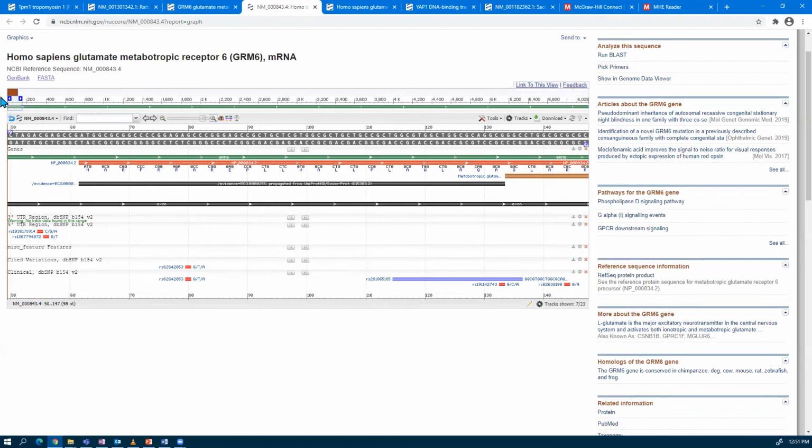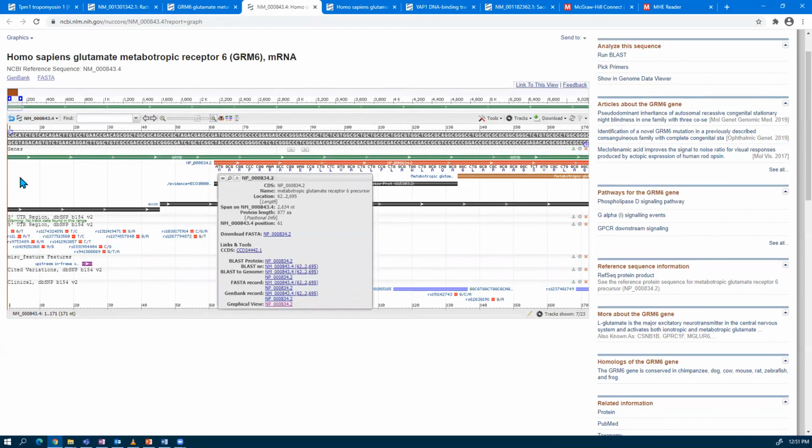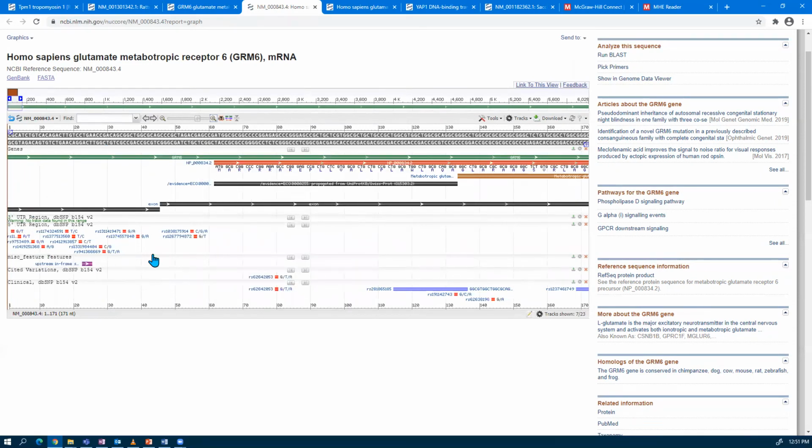first region. Oh, okay, so unfortunately I wasn't zoomed into position 1. So we didn't see this first little bit here, which is good because I thought we had lost some of our noted regions in the untranslated area. So there are multiple, these are the same. This is all from the same database. I was just telling you about that single nucleotide polymorphism database in the 5' untranslated region. So these are all the examples that are known.